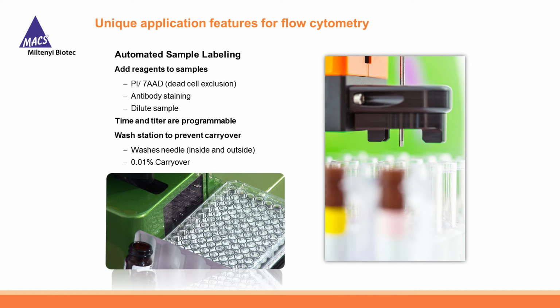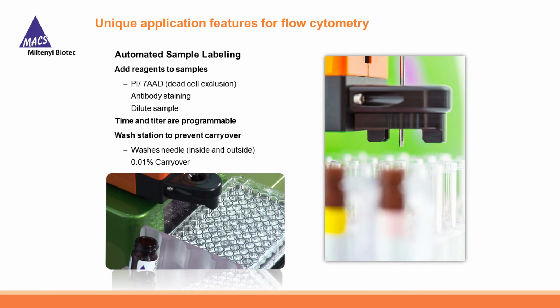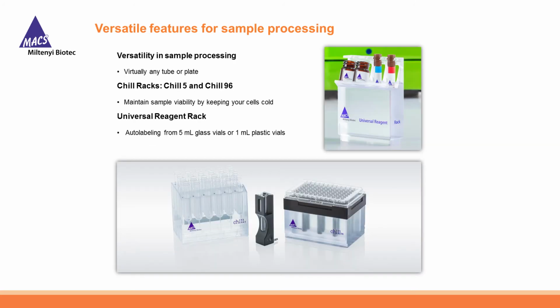So the device is coming out into the reagent vial. It's taking a reagent. It'll add it to any specified wells that you define. In this case, it's going to mix your sample. If there was an incubation step taking place, it would wait and come back after the incubation and acquire the data. So you have a lot of control over how you set up your applications and your assays with this auto-labeling function.